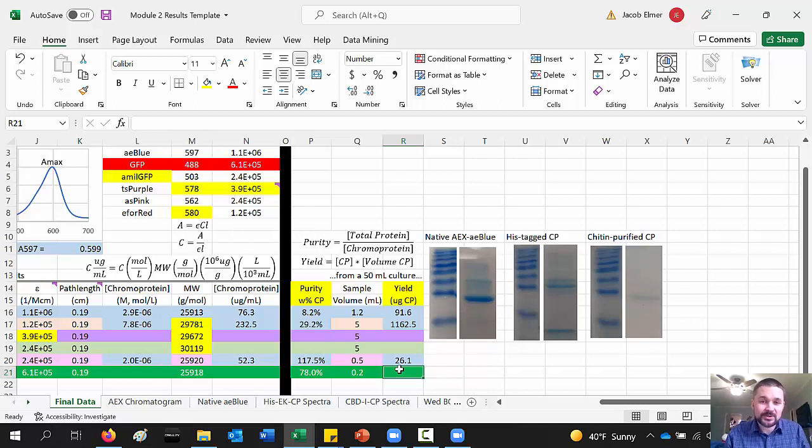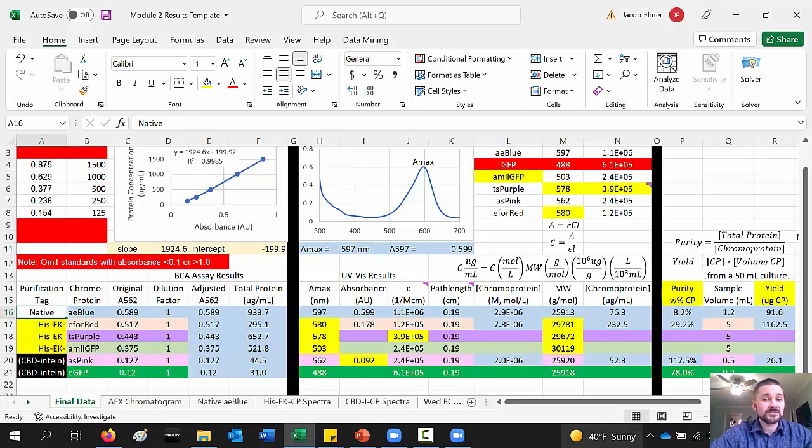You'll see the highest purity with the chitin purified samples, but also the lowest yields. All right, but it's better to have a low yield of 100% purity than a high yield of something that still has something that could be toxic to a human being, right? So there you go. If I was to pursue this further, maybe I would use enterokinase on these samples, just like we talked about on the exam, to get 100% purity there and the higher yield.